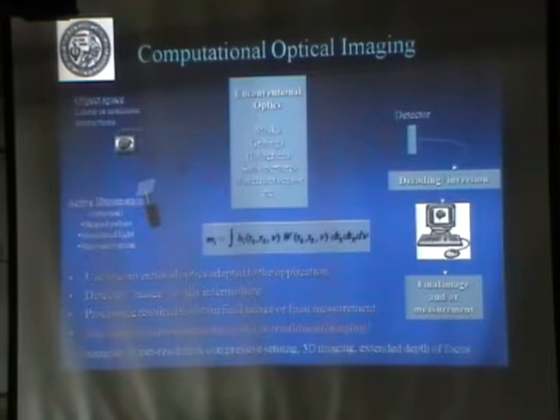So, the degree of coherence. Who knows what interference is? Most? Okay. So when you have 2 points and you try to make an interference experiment, if you can have interference, you say you have coherence. If you can't have interference, you don't have coherence. So then you need to correlate all the points in space. You have the coordinates of each point, which is 3-dimensional, the coordinates of the other point, 3-dimensional, and then you have the frequency, so it's a 7-dimensional thing.